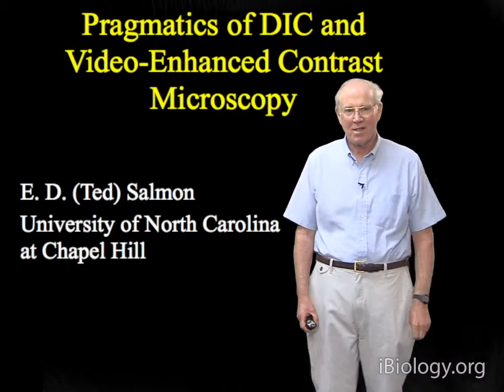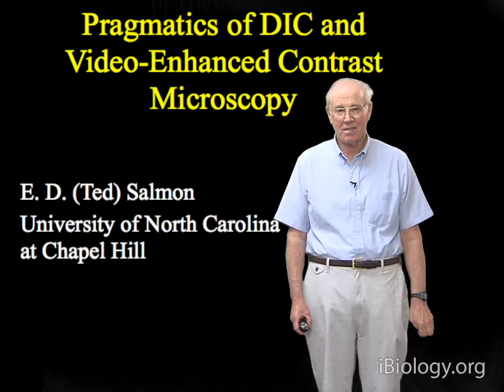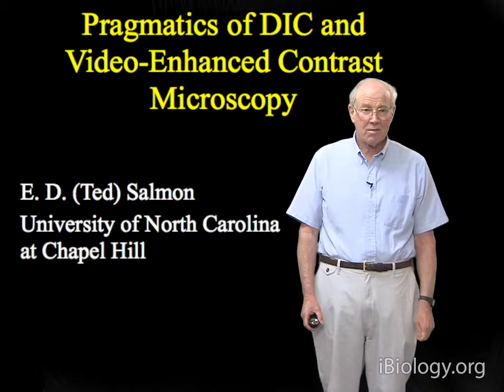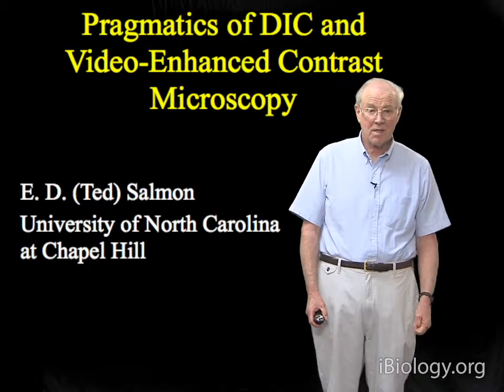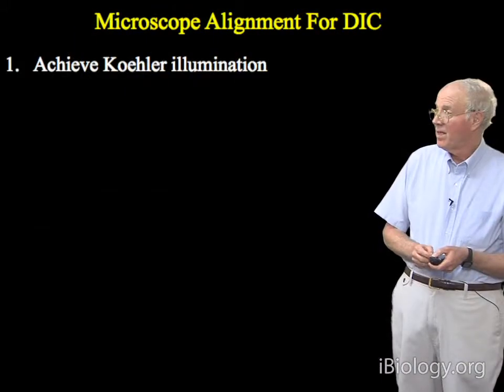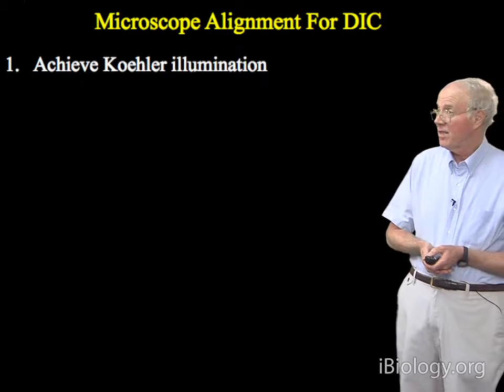Hi, I'm Ted Salmon, and I want to talk here about high-resolution video or digitally enhanced DIC microscopy. This is a second talk in a series on DIC microscopy. In a previous lecture, I talked about the principles of DIC microscopy and image contrast generation in the DIC microscopes. Now, a few words about alignment for DIC.